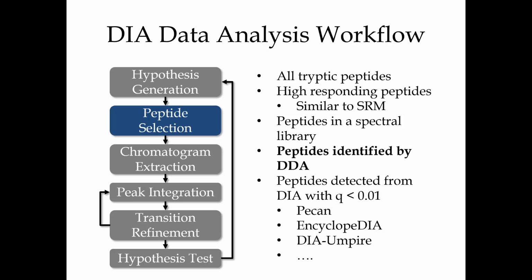Yeah. But you can't use Mascot for DIA. Why not? You can't use Mascot for DIA. You've got to remember, you can't use Mascot for DIA because it's a spectrum search tool, right? So you can't search the spectrum with Mascot. It's a convoluted spectrum, but what we're doing is extracting chromatograms out of it to use for quantification. So it's a different thing.